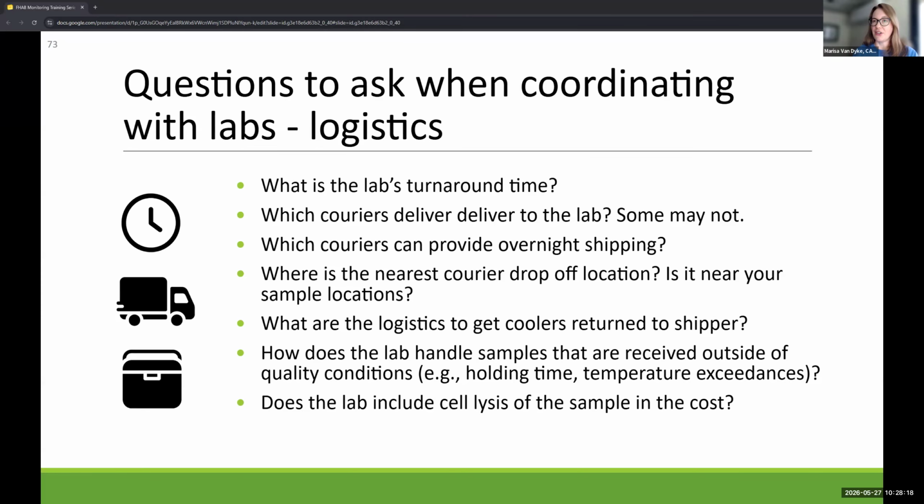That's another constraint on your sampling plan, week to week or month to month. Often we limit our sampling to Monday through Wednesday, so that we can make sure that we can chill our samples and ship them in time to reach the lab during its open business days.